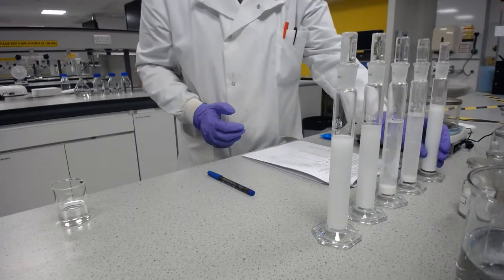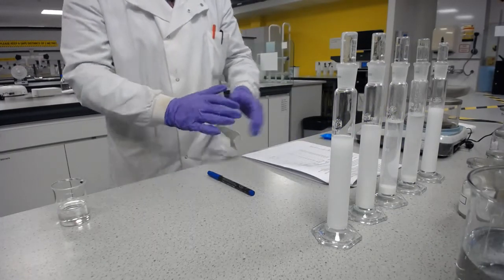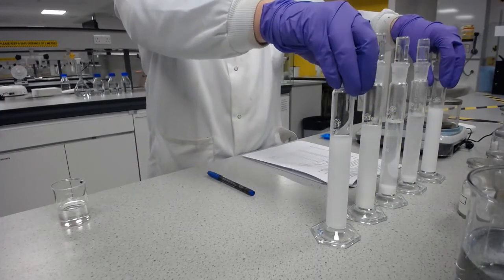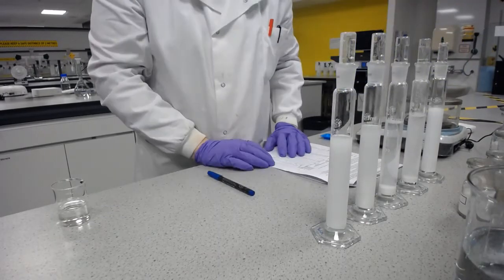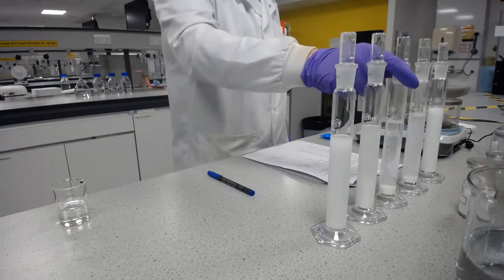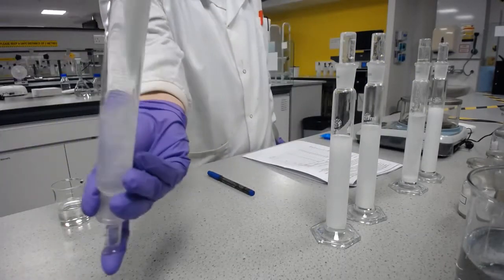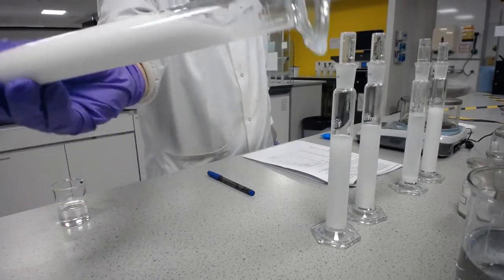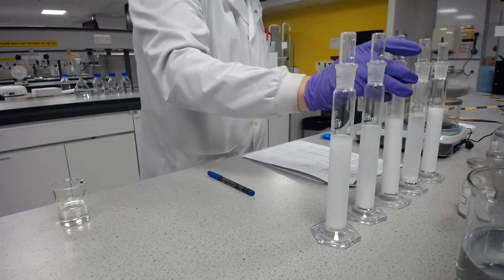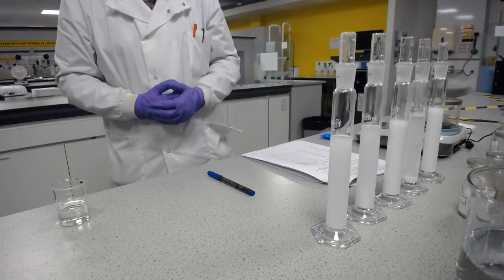So there we have it. That is the influence that the electrolyte strength can have on the medications. Too low, too high, no good, we can't give it. Goldilocks region, somewhere in the middle, where we get flocculation. We have formulations that, whilst they may fall apart, they can be mixed very easily. And we'll move on to the second part where we're making calamine lotions now.